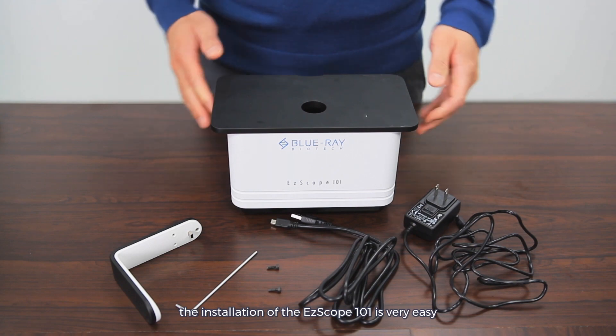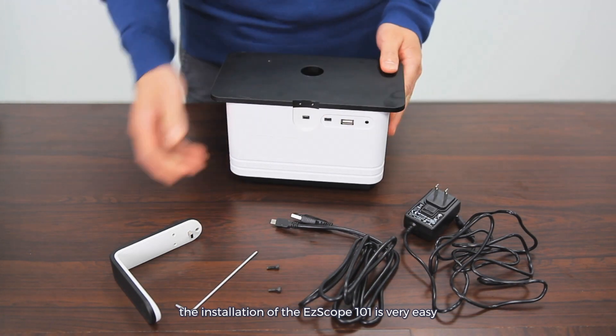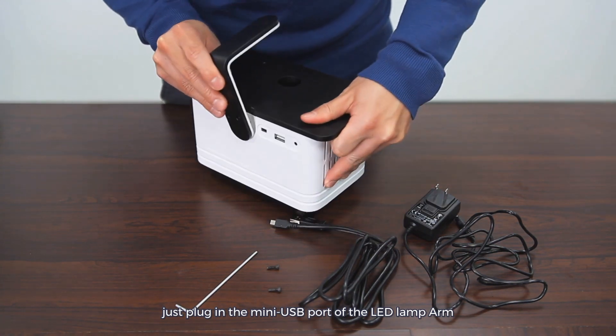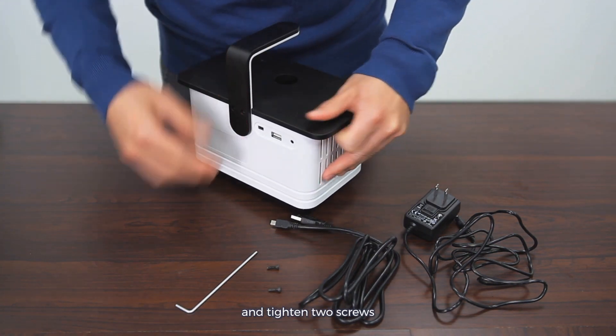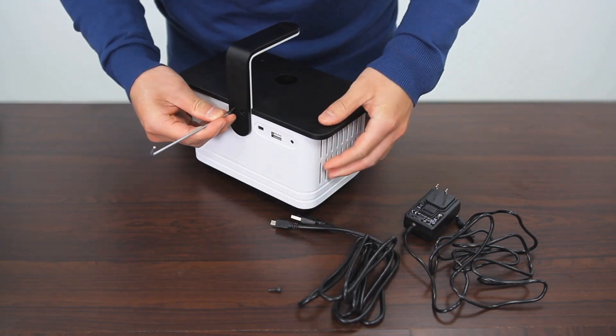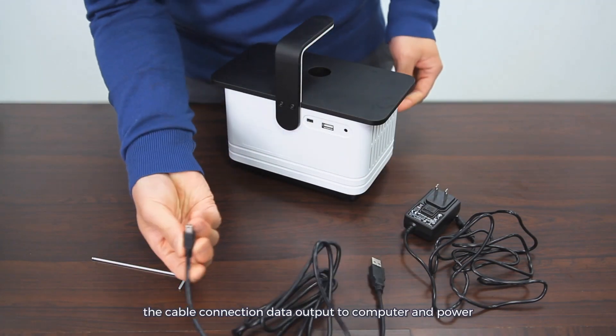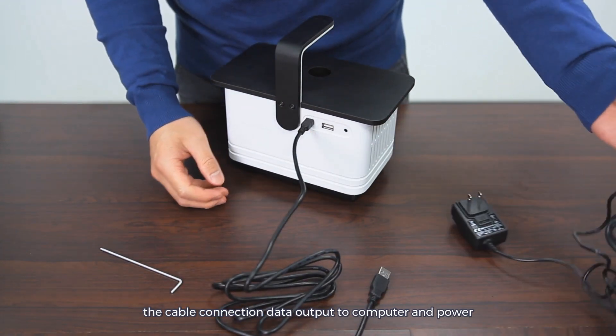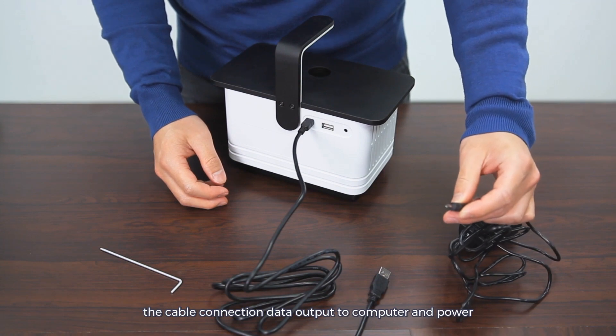The installation of the EZscope 101 is very easy. Just plug in the mini USB port of the LED lamp arm and tighten two screws, the cable connection, data output to computer, and power.